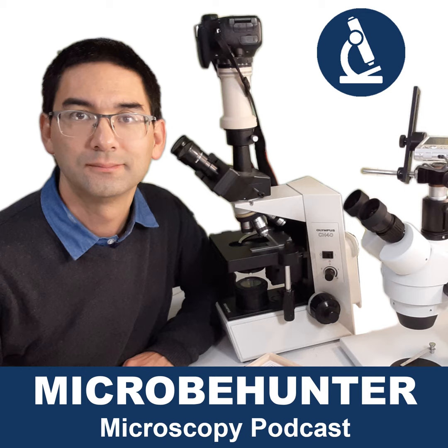Okay, so what you do is you always multiply the magnification of the objective with the magnification of the eyepiece. Now, if you want a higher magnification, you can buy a more expensive objective that magnifies more. That is actually the way you should do it, because this way you also preserve the resolution. You get a clearer image.